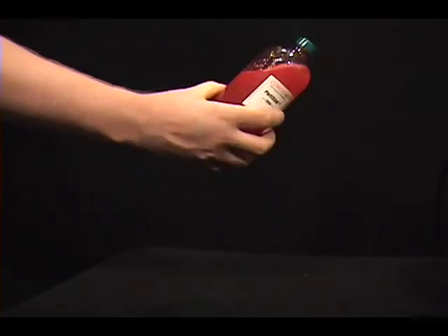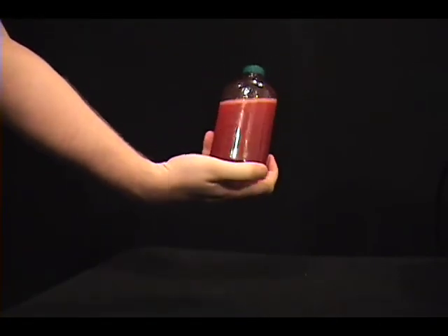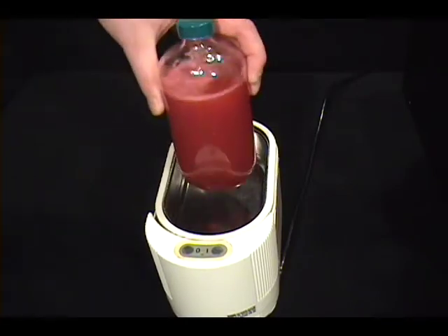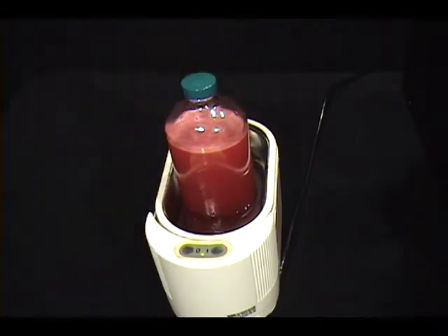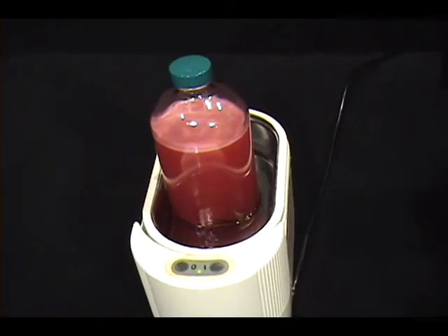The sample is first prepared by shaking it vigorously in order to suspend the particles in the sample. In order to remove the air bubbles created during shaking, the sample is placed in an ultrasonic bath.